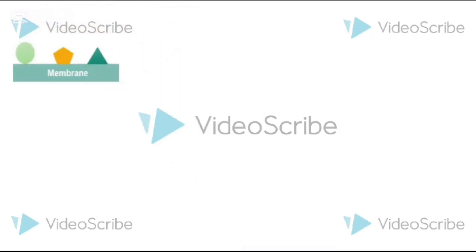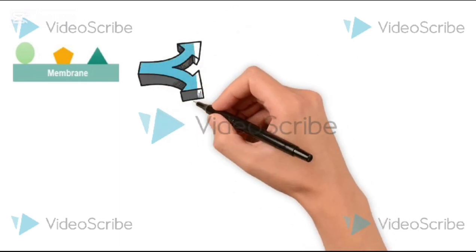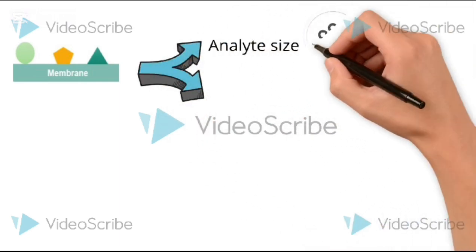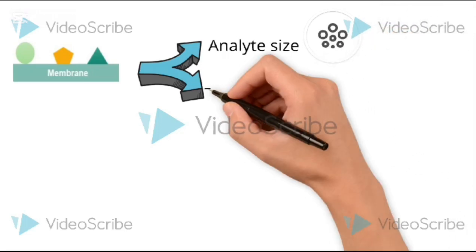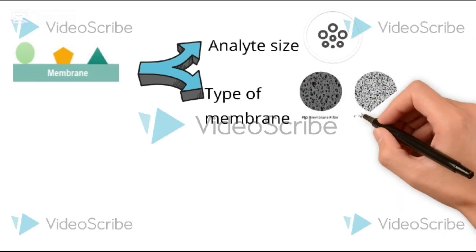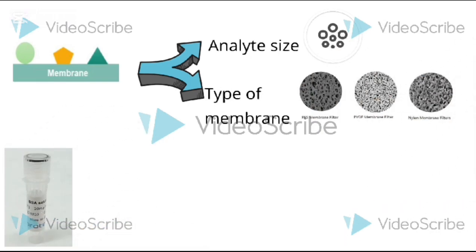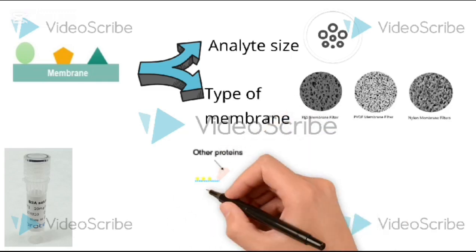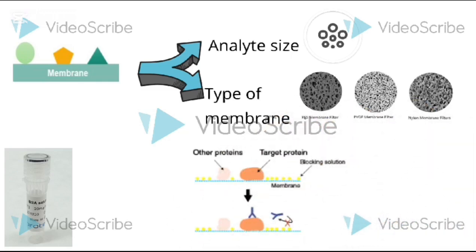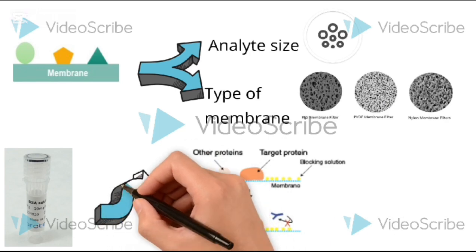The transfer time for the binding of the proteins on the membrane depends on two factors: the size of the analyte, that could be small, medium, or large, and the type of membrane we are using, that could be the nitrocellulose membrane or the PVDF membrane. BSA, bovine serum albumin, is used to block the membrane by incubating it in BSA buffer to prevent non-specific binding, and washing is done to minimize the background noise.